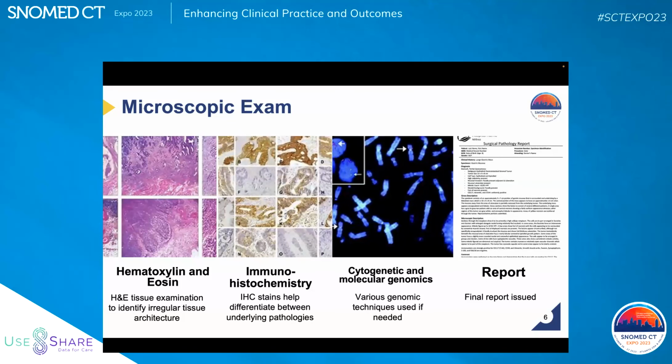Blue is acid, red is basic, in terms of the chemistry of the tissue. So basically your nucleus, with its nucleic acid, is an acid, and it will stain dark blue. The badder, the bluer, something like that, depending.